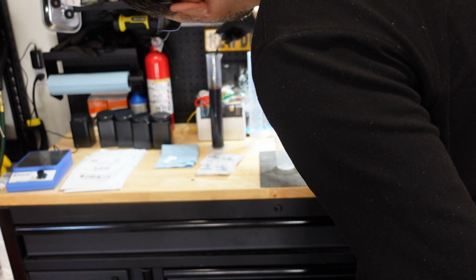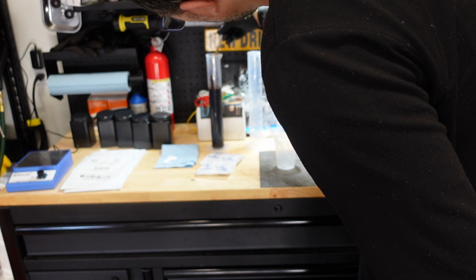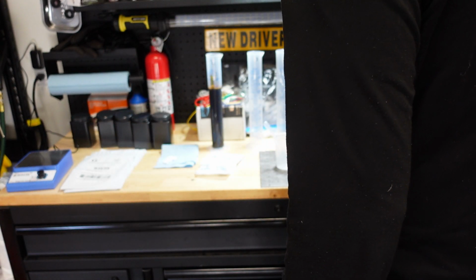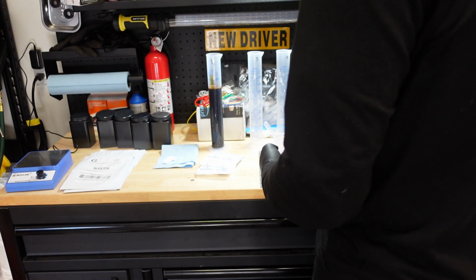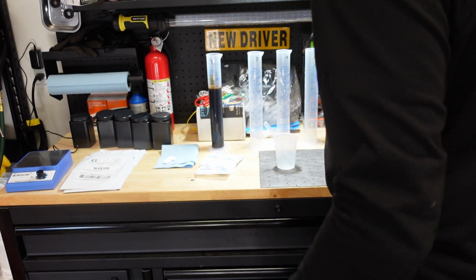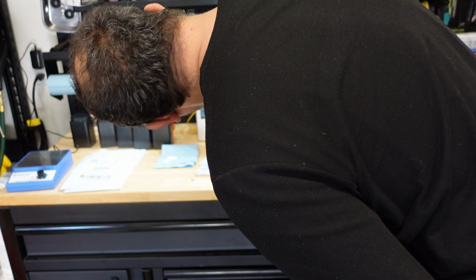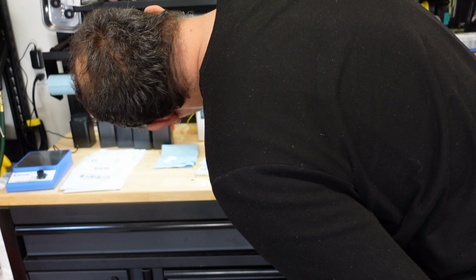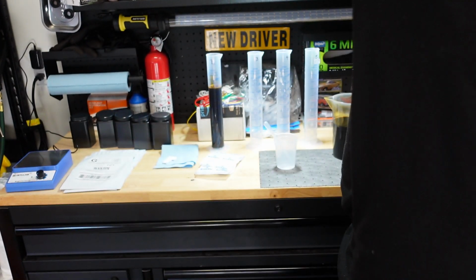Okay. And because technically we're dealing with such a very large percentage of gas relative to the amount, for example, 1% gas should be 2.5 mLs of gas in this beaker. That's actually a good amount. So we're still refining this, getting as close as we can to 220. Let's see. Yeah, that's right on 220 there.